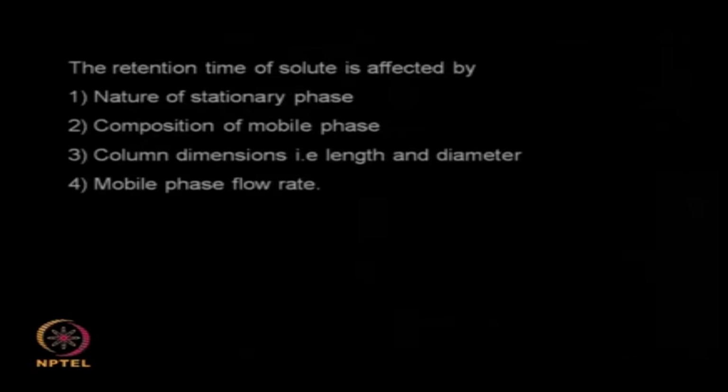So what are the factors that determine the retention time? The nature of the stationary phase, the type of stationary phase, the porosity, particle size distribution, type of ions present, hydrophobicity of the surface, so many factors. Composition of the mobile phase: is the mobile phase hydrophobic, is it a hydrophilic solvent, and so on. Then the column dimension: how long is the column, what is the diameter, what is the number of theoretical plates, and then the flow rate of the mobile phase. So all these factors determine the retention time of your sample.